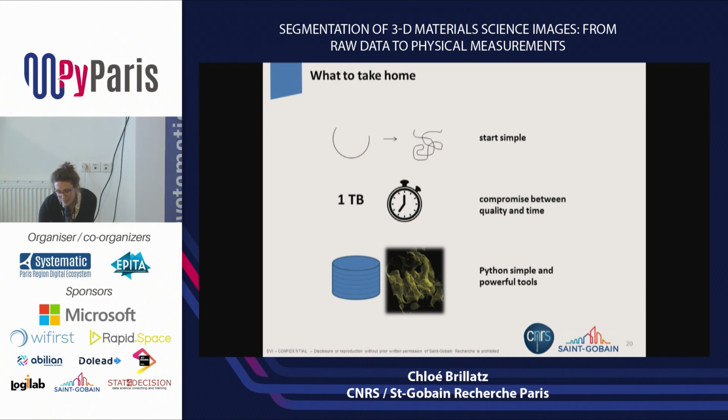Plus, thanks to Python, you can have simple and powerful tools. So the 3D visualization was really useful to do qualitative checks. And also, as I told you earlier, the parallel module was also really efficient to go from my test phase to the production phase.